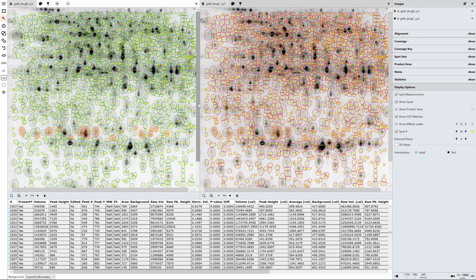So we try and facilitate all users that are doing this work within our SpotMap software by giving you basically free access to all of the background information that the software uses to make coverage decisions and other decisions in terms of detection parameters and things like that.